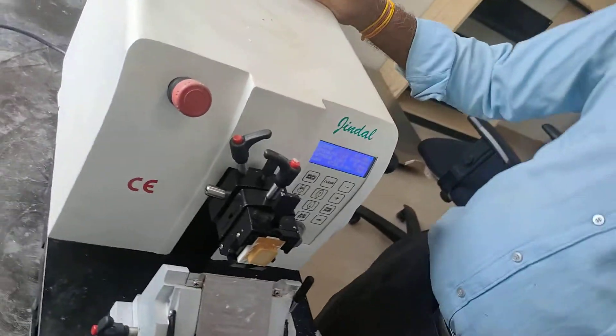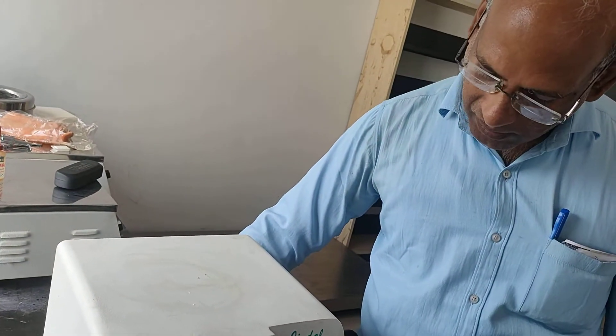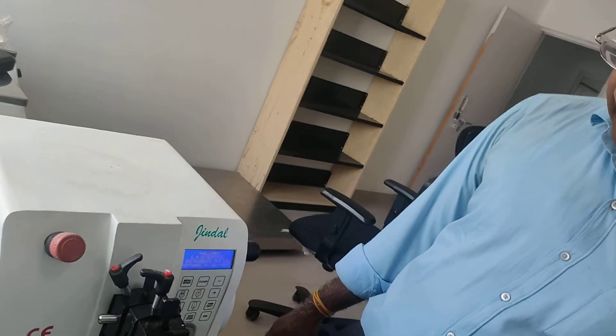Sir, we have a microtome. First, we put it on the back of the switch. It's supposed to be in that position. We put it on. After doing it, what do we do?